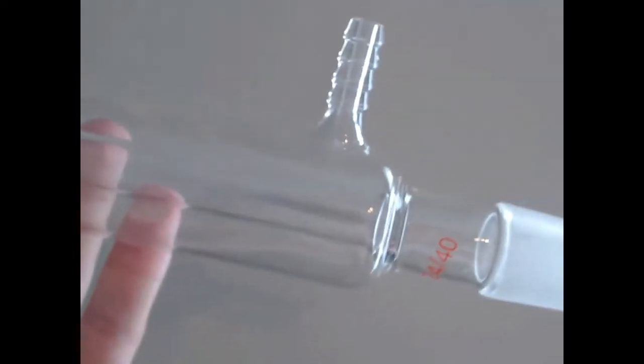This is the condenser, which contains a tube within a tube. This is so water can enter the outer tube, encasing the inner tube in a cold environment.